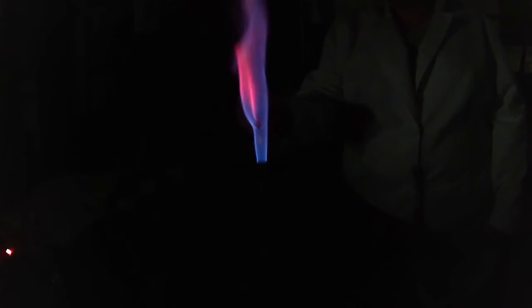Okay. That one's very pretty. So here's our lithium one. This one turns things pink. Hot pink flame makes lithium. So lithium puts off a hot pink flame.